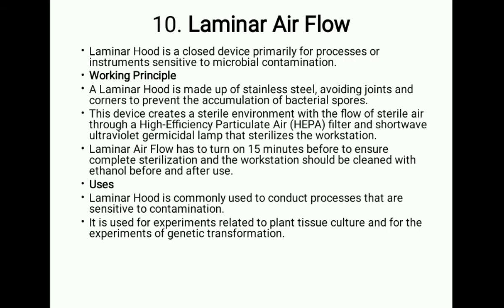This device creates a sterilized environment with the flow of sterilized air through high efficiency particulate air filters and a short-wave ultraviolet germicidal lamp that sterilizes the workstation.